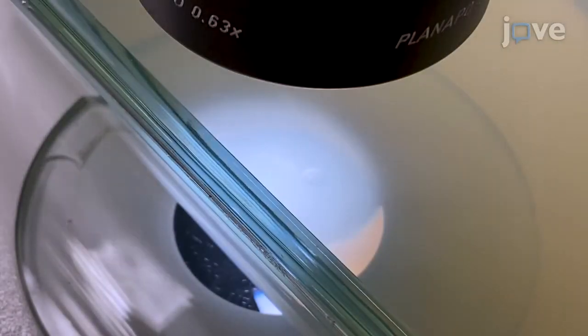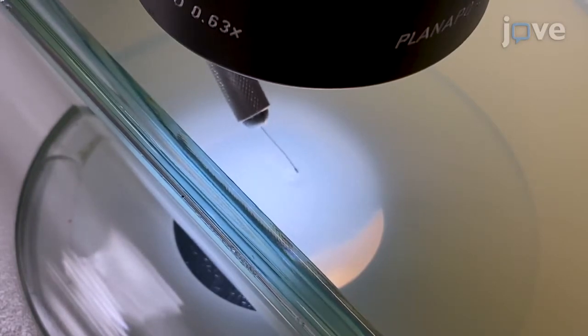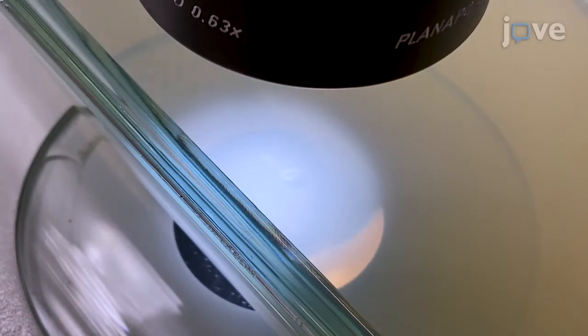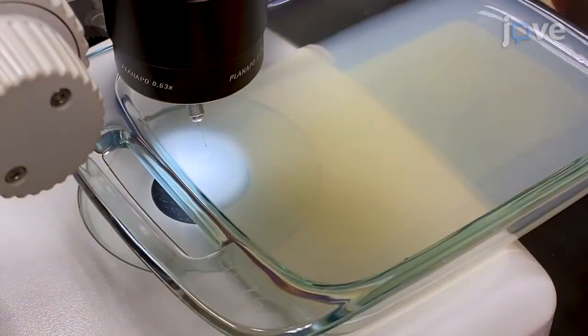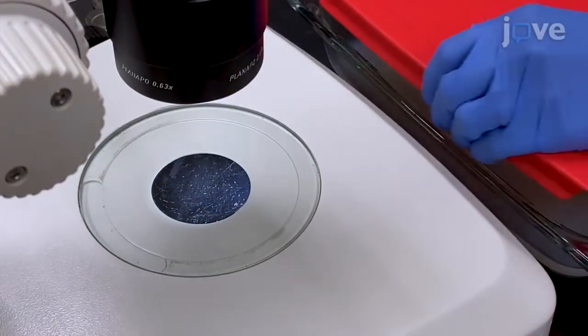Place the gravid adult into the alkaline hypochlorite solution and tap the nematode to disrupt the cuticle and to release eggs. When a total of five adults have been placed evenly around the E. coli lawn in the same manner, place the lid back onto the plate.